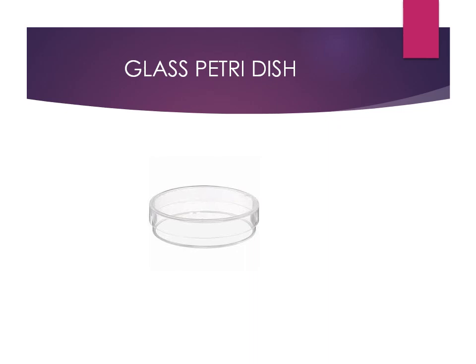Now if it is a glass petri dish, what is the use of this petri dish? That is for pouring the media. Whenever you are making the plates, you are pouring any media, like blood agar, so that you can pour it into this and leave it there. It will solidify and then you can use it.